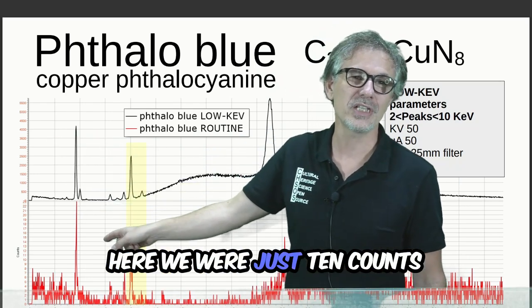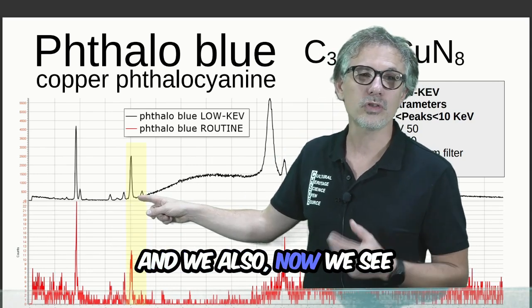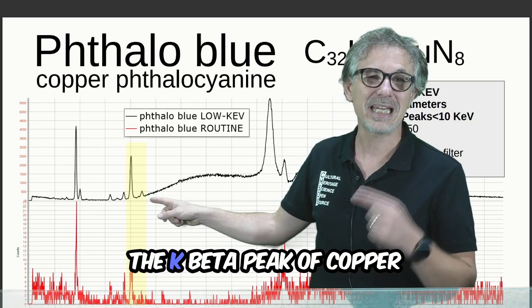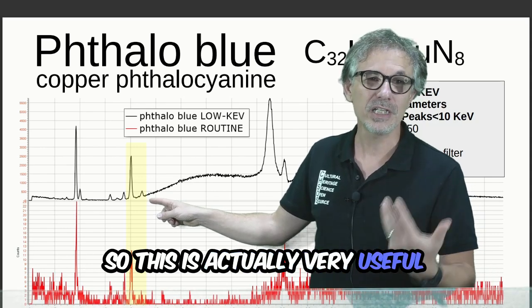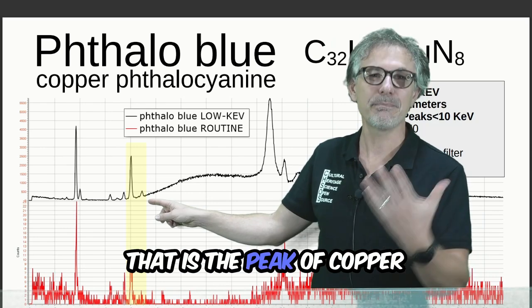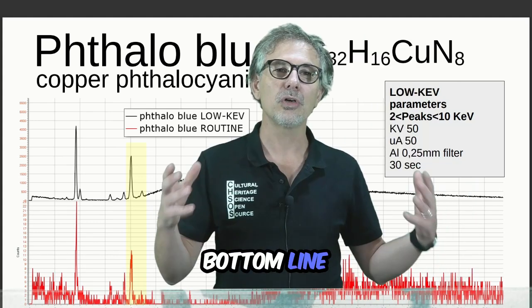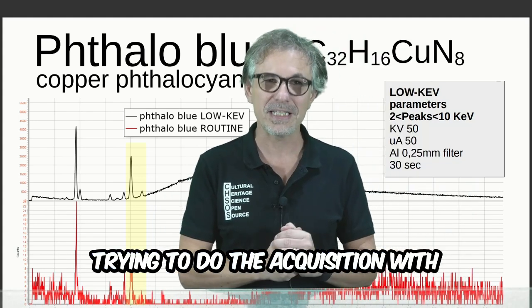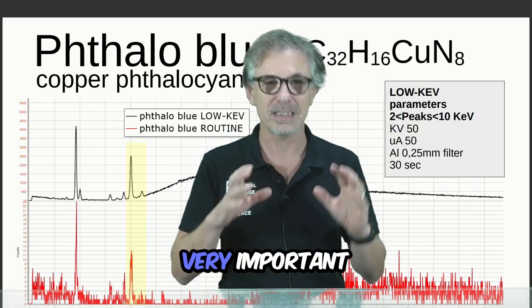Before we were at just 10 counts, and now we also see the K beta peak of copper. This is very useful because we have confirmation that it is the peak of copper, since we have both of them. Bottom line, trying to do the acquisition with the low keV parameters is very important.